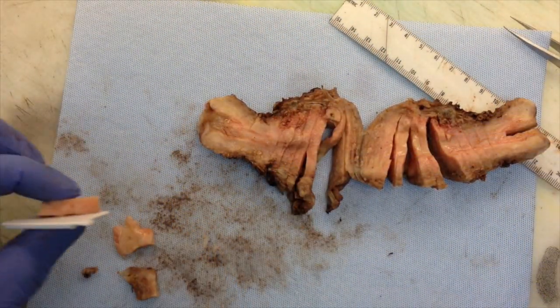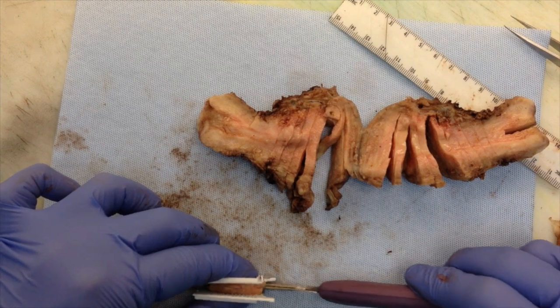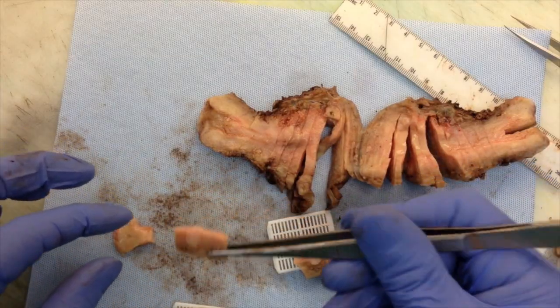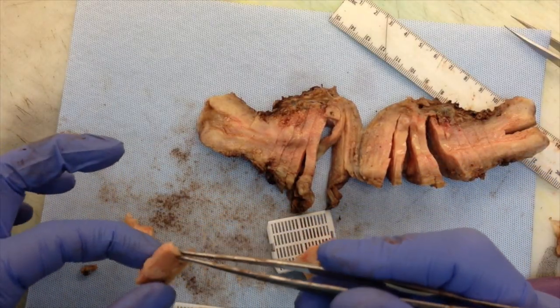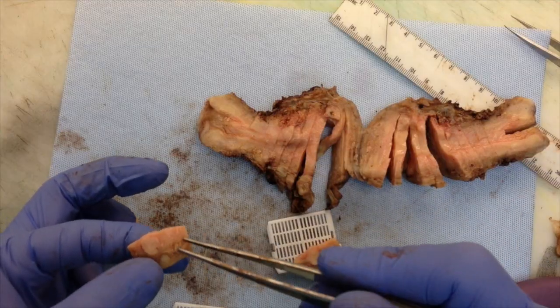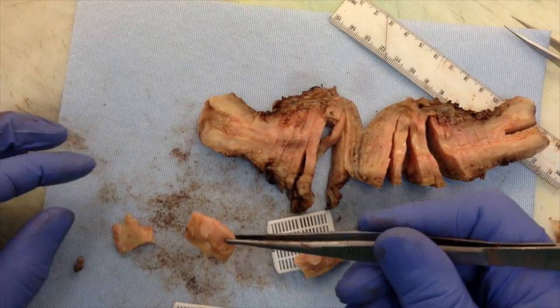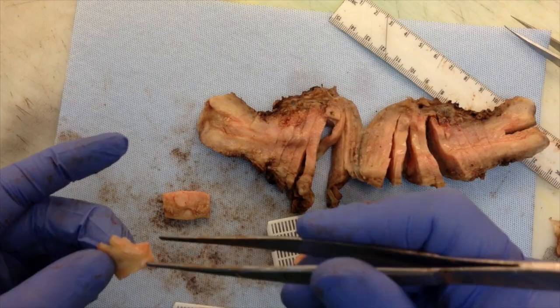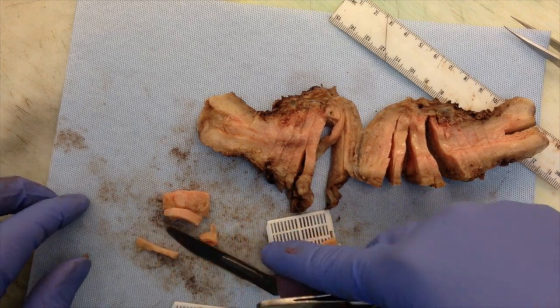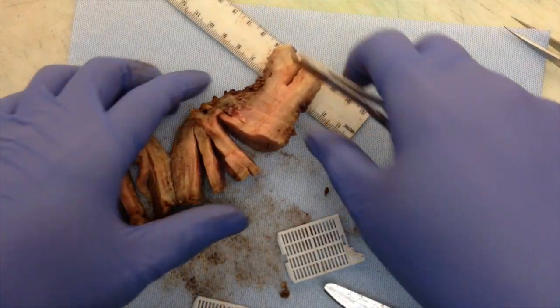So first I'm going to thin this down. Your section should be about 0.3 centimeters in thickness. So here is almost a full thickness. There's probably a little bit of endometrium here. So serosa here, and then myometrium, and there's some trabeculations, and looks like there's some glands in here, so it's evidence of adenomyosis. And here's a lot of endometrium, so I'm just going to cut a piece of this to submit alongside this piece, so you get more endometrium. So it would look like this. And now we'll go to the posterior.